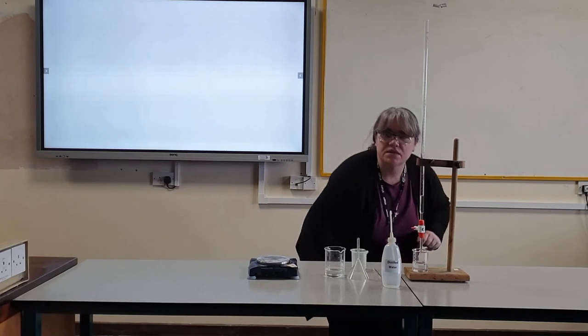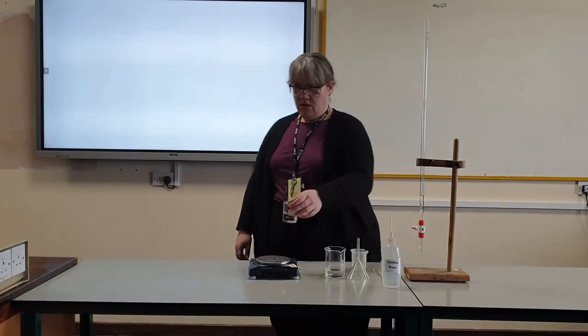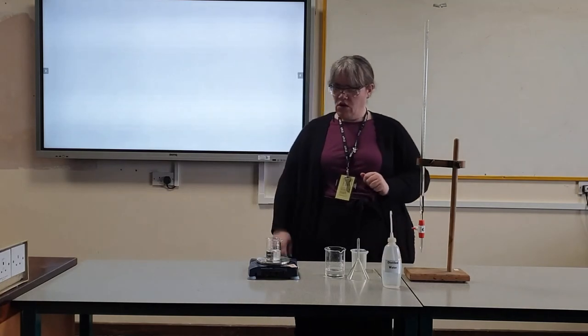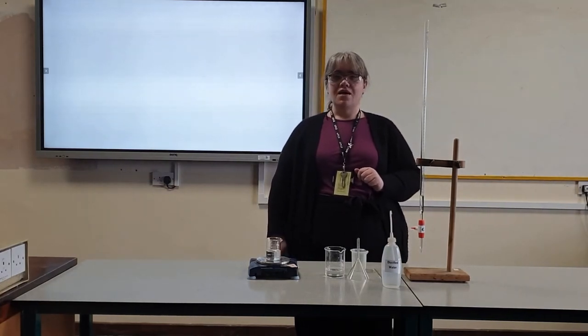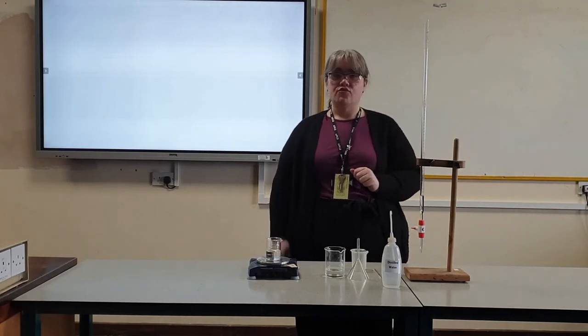I'm now going to release the water until it reaches the 50 centimetres cubed mark. Go down to eye height and stop when the meniscus is sitting on the 50 centimetres cubed line. I then record the mass of my beaker and water, and I repeat that three times.